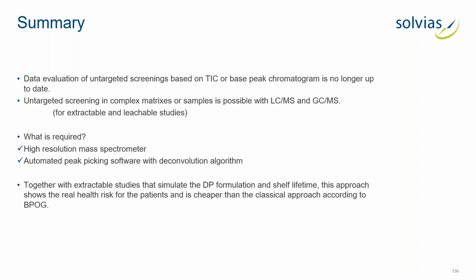And we get much better ideas of what is leaching out of our material, instead of getting some surprises later when we are doing the leachable study and are confronted with some unknown peaks that could have been found before without any issue.